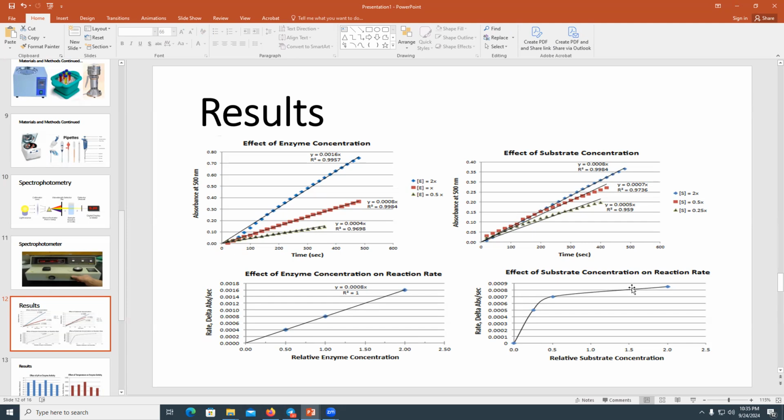these protein channels, which are also enzymes, have been saturated. So this is something that we're going to appreciate in this lab: it's not like the more enzyme you add, the faster you'll go until you run out of substrate. In the beginning, the more substrate you add, the faster the reaction will go, until you hit a point where we reach a transport maximum or a ceiling effect.